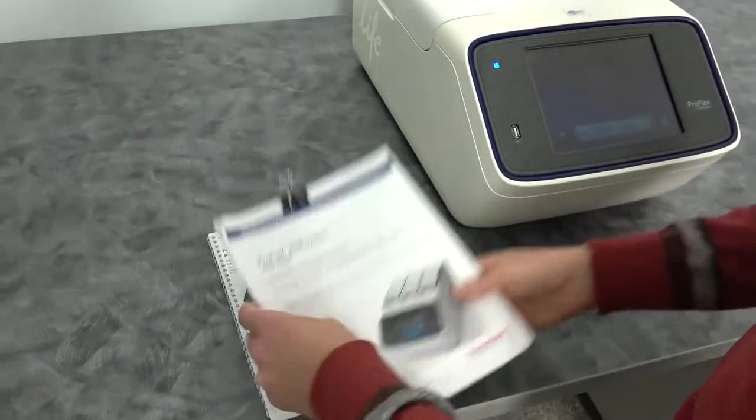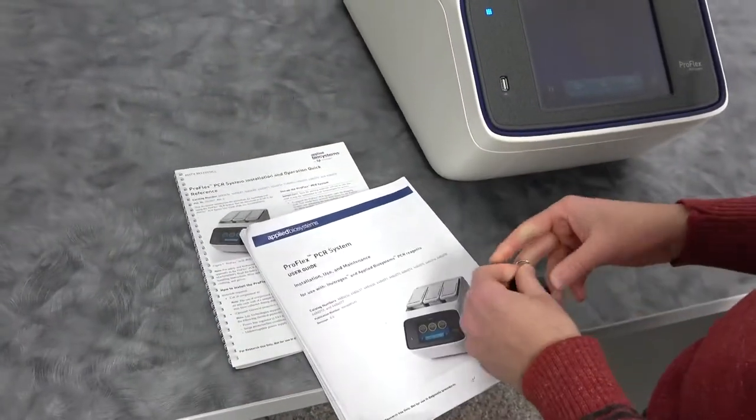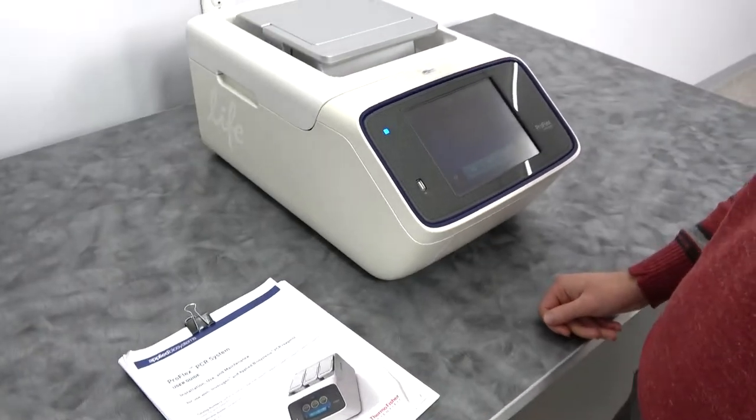There's also a little user guide, which we've printed double-sided. You're going to want to remove the clip when you use it. Actually, I don't think we printed this — it came this way — but it's handy to have around. Nobody has to look up on the computer. Sometimes paper is just better.